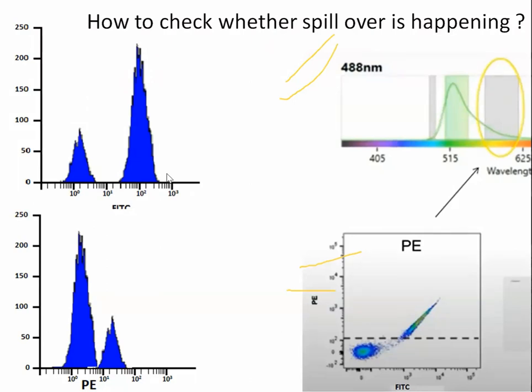Basically, we stain the cells with only one particular fluorochrome and observe for signal in all the channels. Ideally, you should get signal only in the channel of the fluorochrome which you have stained. For example, only the FITC channel should show signal if you have stained the cells with only FITC. If you get signal in PE, ECD or other channels, it means the FITC fluorescence is getting spilled over into the other channels and you need to correct it. That's how you check whether spillover is happening or not.